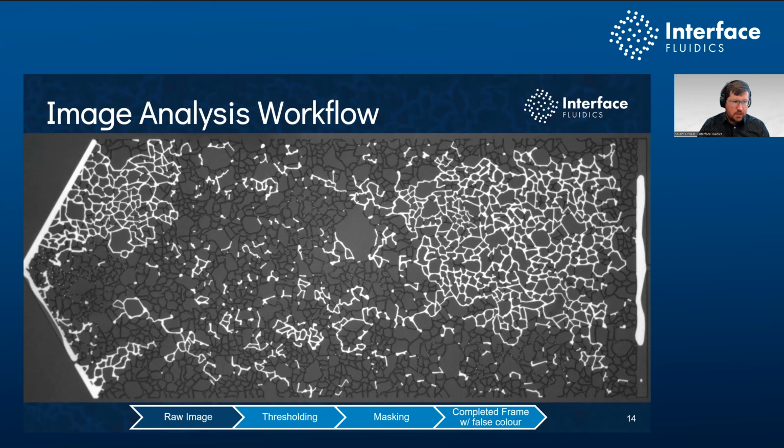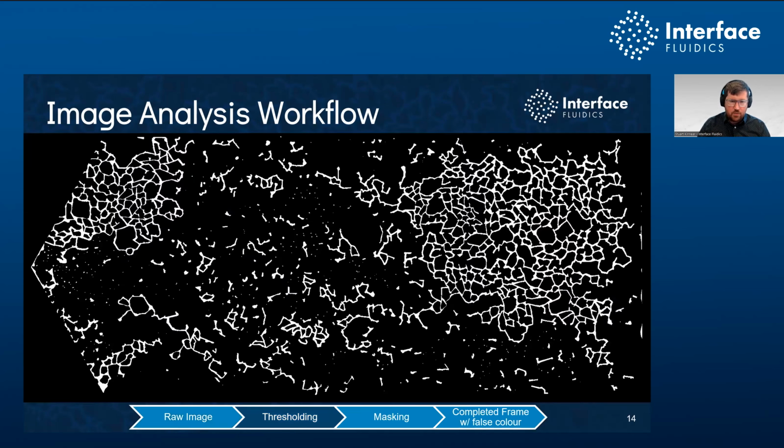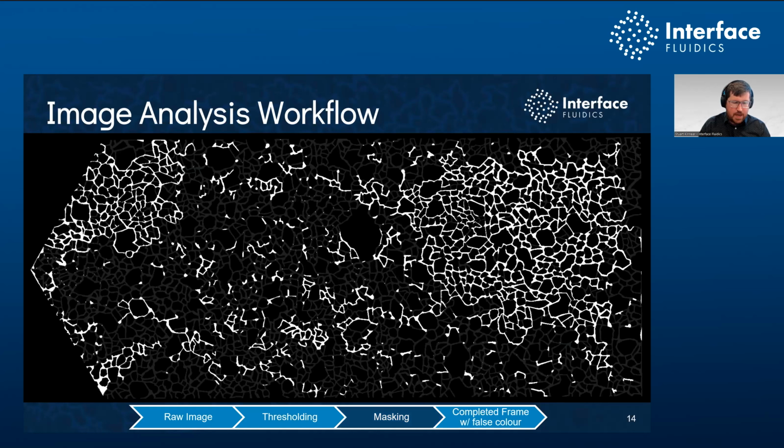In order to understand and quantify that recovery and saturation, we then convert that image to a binary image so that we know exactly where the oil is and is not. And we have a quantifiable process for saying exactly how much oil is in there. Now, what we do is we then go back and we mask back in where all the channels were so that we know where all the water saturation is. So now we can quantify water, oil, and pore volumes.